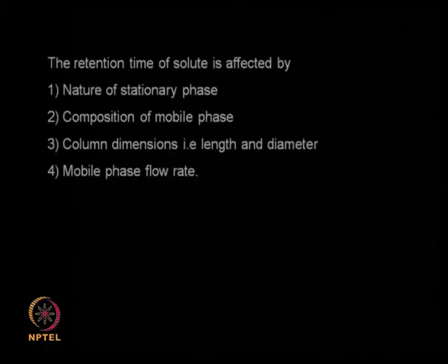So what are the factors that determine the retention time? The nature of the stationary phase, okay, the type of stationary phase, the porosity, particle size distribution, type of ions present, hydrophobicity of the surface, so many factors. Composition of the mobile phase, is the mobile phase hydrophobic, is it a hydrophilic solvent, and so on. Then the column dimension, how long is the column, what is the diameter, what is the number of theoretical plates, and then the flow rate of the mobile phase. So all these factors determine the retention time of your sample.